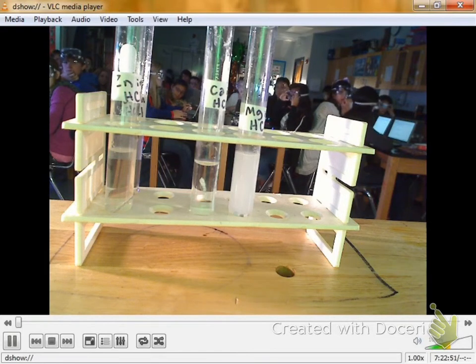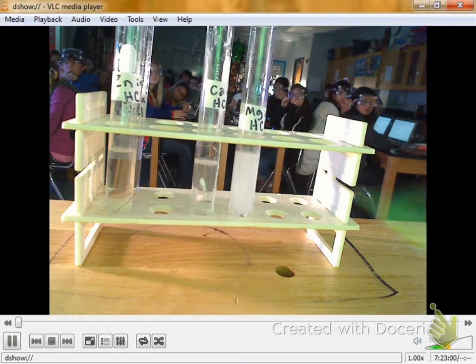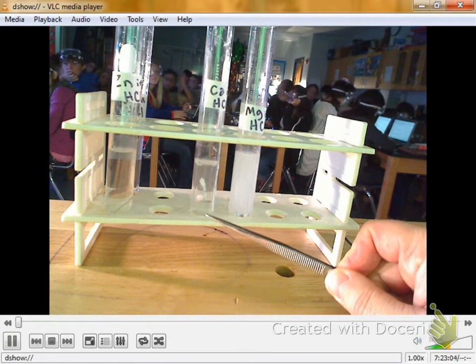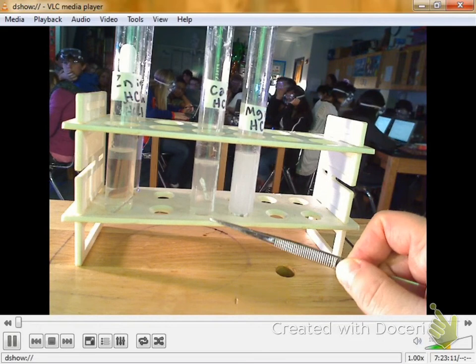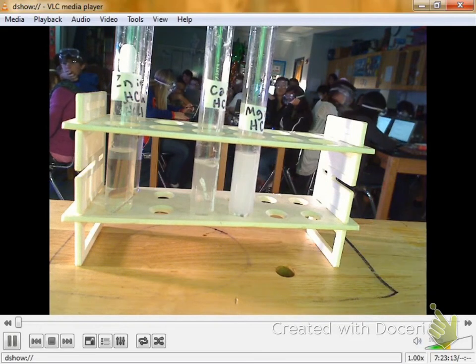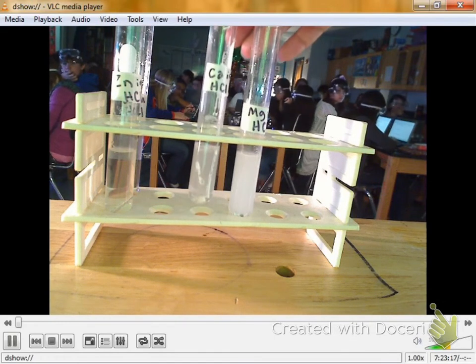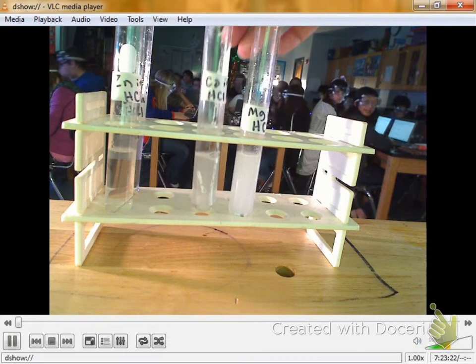When I put the calcium in the hydrochloric acid, oh boy, you can see it kind of bouncing around down here. He's kind of hard to see down there because of the bend in the glass.